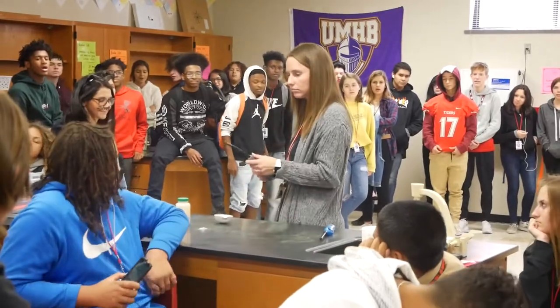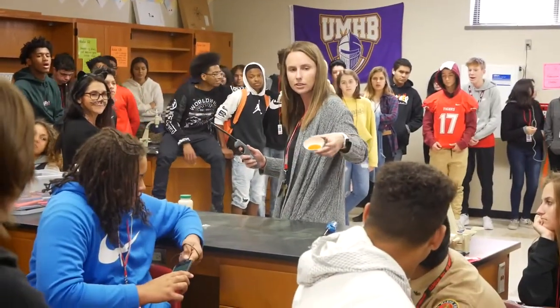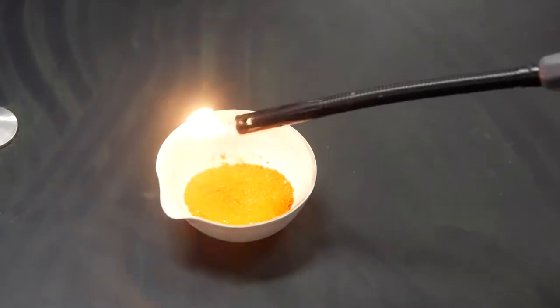We're just going to light it on fire? Let's move. Throw a color in right now — go in red. Let's go ahead.